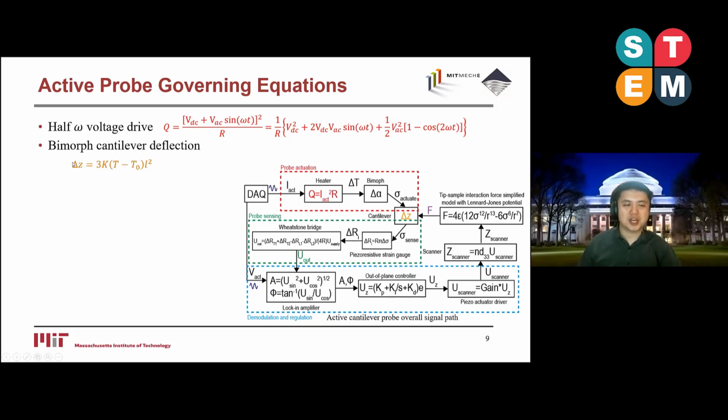So in this case, we have this delta Z directly proportional to this, so that we can control the cantilever static deflection through resistive heating. We can also prove from basic mechanics that the cantilever force is related to its deflection ZL by this formula, as well as the tangential angle, theta L, by this formula. So basically, they are linear relationships, which allows us to do the measurement in an easier way, because of the linear relationship in this purple F.